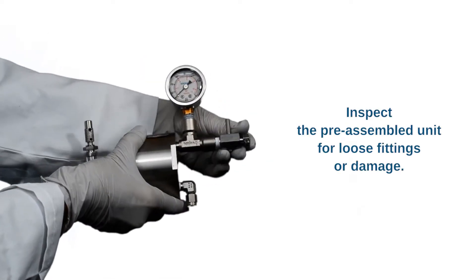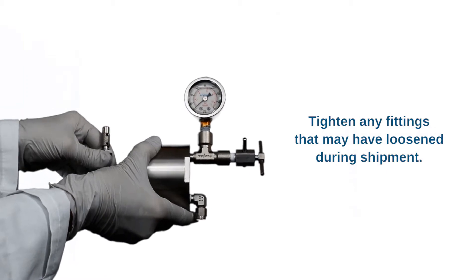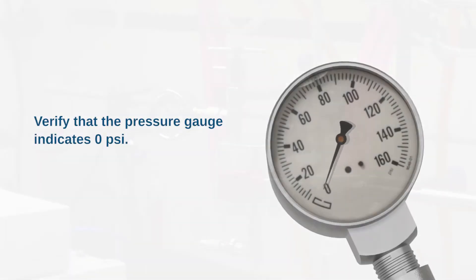Step 1: Inspection and assembly. Inspect the pre-assembled unit for loose fittings or damage. Verify that the pressure gauge indicates 0 psi. If the gauge does not read 0, please contact us.